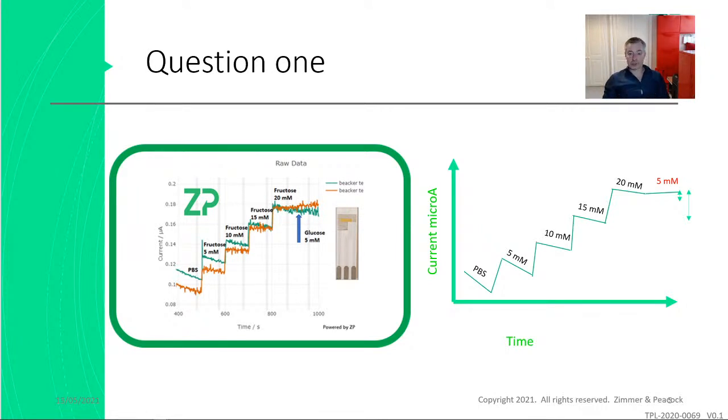And if you really wanted to make a very accurate fructose sensor, you could put a true glucose sensor in alongside it and adjust the signal. But I just want to back up slightly and say that in this kind of experiment, we do this quite a lot. If you're doing an enzyme-based sensor experiment, you would probably do the same.